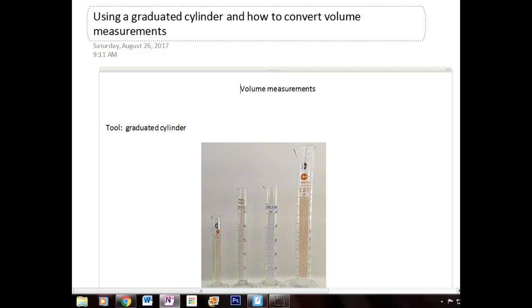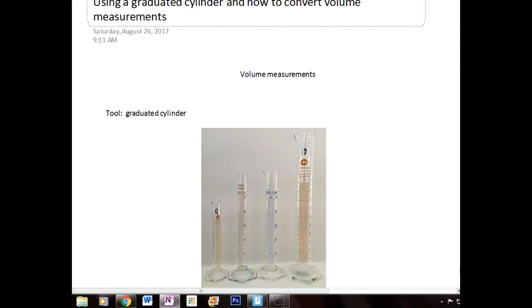This is a video for general chemistry students on how to accurately use a graduated cylinder and get good results when you're measuring volume, and how to convert volume measurements. So let's dive right into volume measurements first.